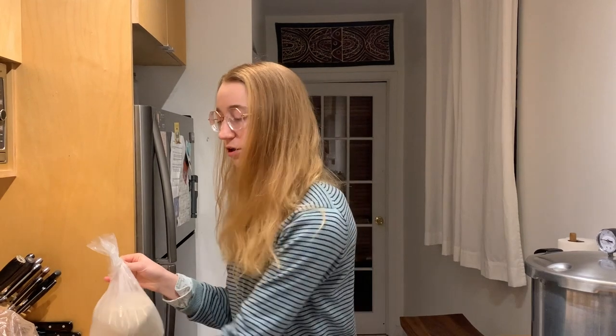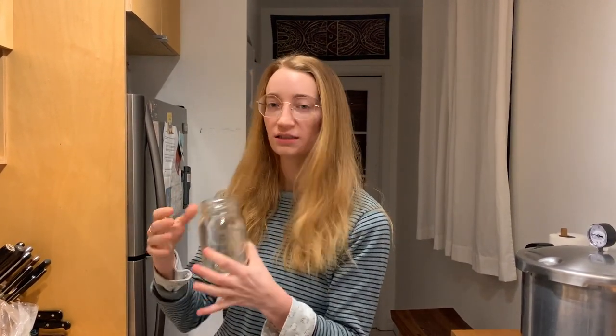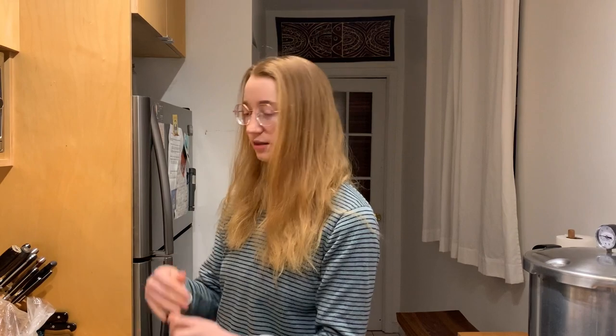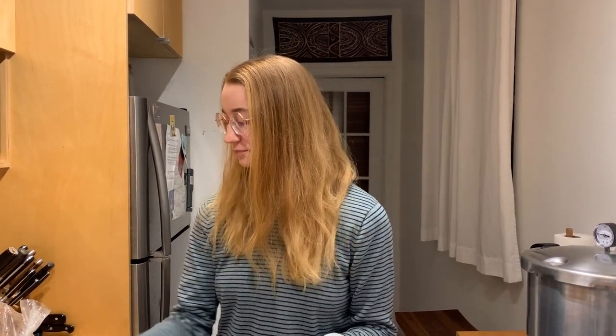What you'll need is dextrose and barley malt extract. The ratio is four parts dextrose to one part barley malt extract. You'll need 20 grams per 500 milliliters, so the quantity you're making really depends on the number of jars you're making. We recommend mixing those two together to form one powder and then measuring out 20 grams per jar.